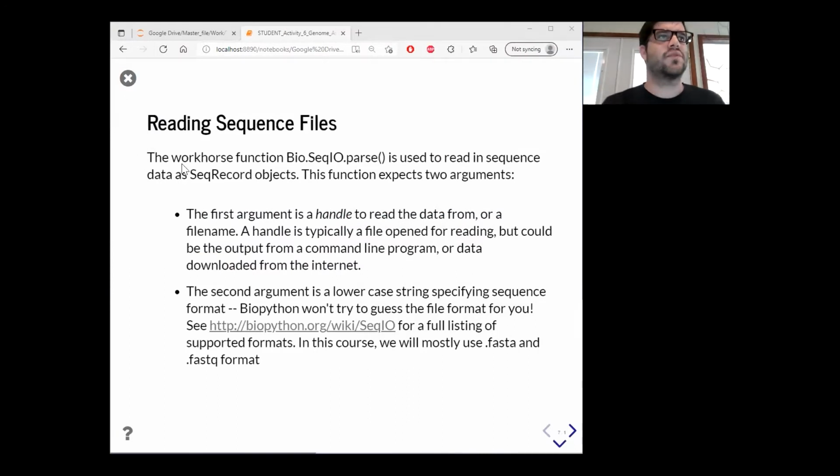So far we've learned how to work with individual seq objects. These are individual strings that might have a couple hundred to a couple thousand characters. But in general, when we're doing bioinformatics, genomics, or computational biology type analyses, we're working with large files. So you might be working with a genome that could have dozens to hundreds of chromosomes or contigs in it, or you could be working with a raw sequence file, such as a FASTQ file from maybe Illumina or PacBio sequencing, where you might have millions or billions of individual sequences.